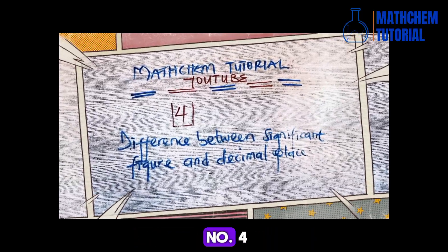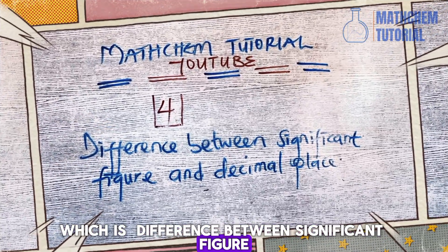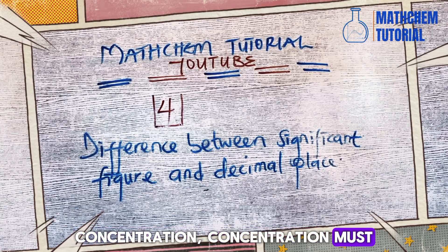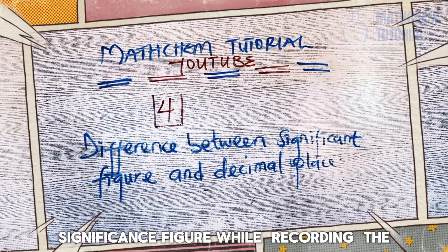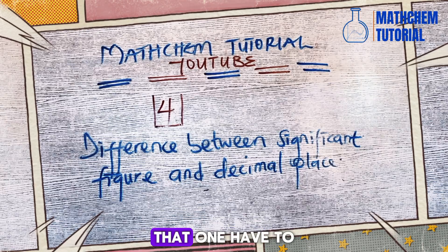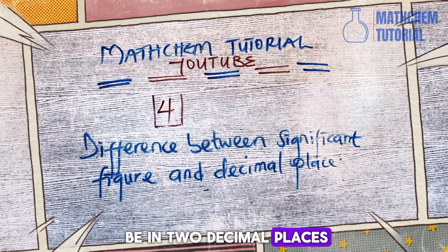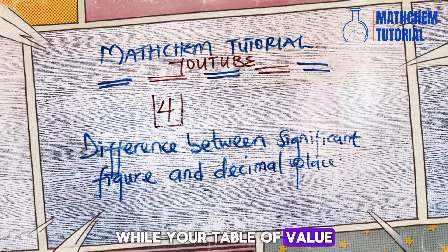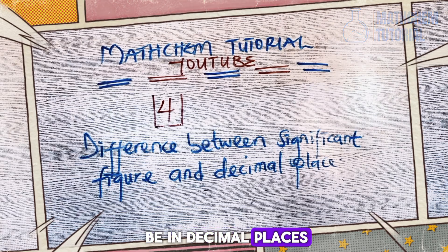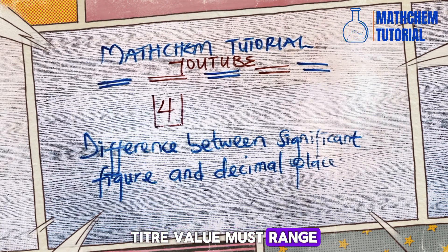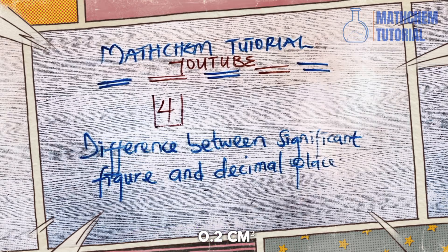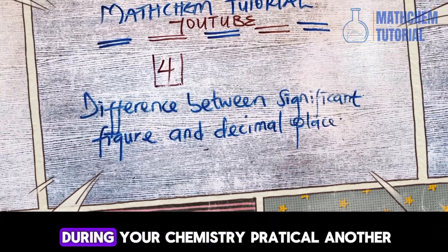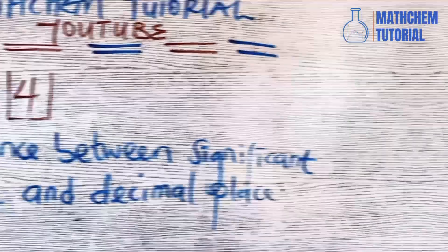Number four is the difference between significant figures and decimal places. Students should take note: concentration must be expressed in three significant figures, while the titre value must be in two decimal places. Your concentration must be in three significant figures, your titre value must be in two decimal places, and your concordant titre value must range within plus or minus 0.2 cm³. These are things you need to note to avoid losing marks in your chemistry practical.